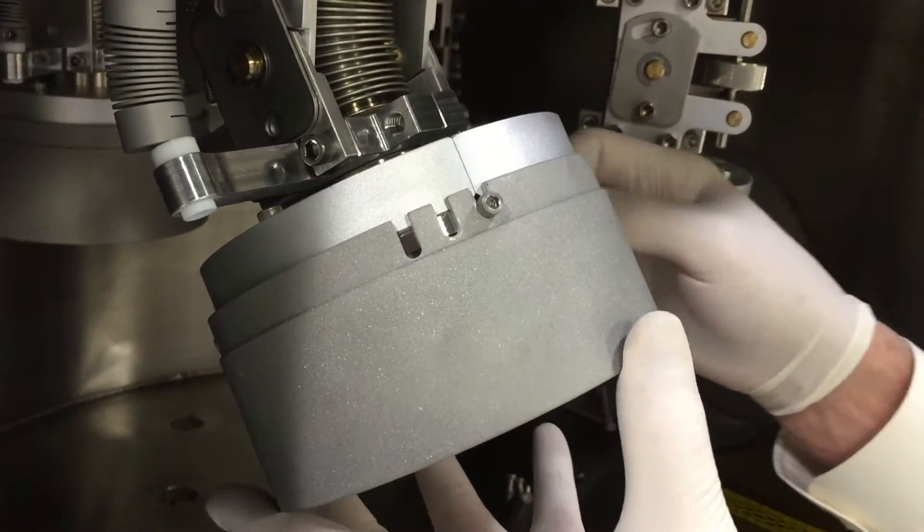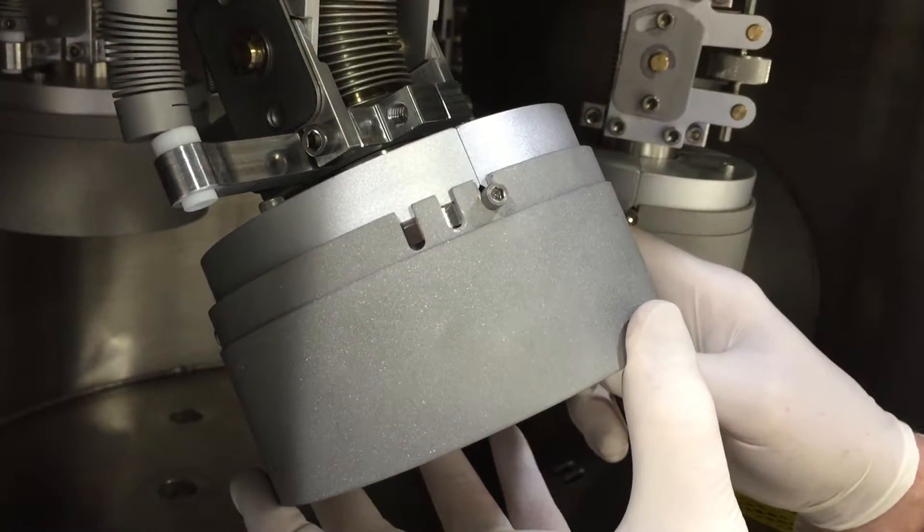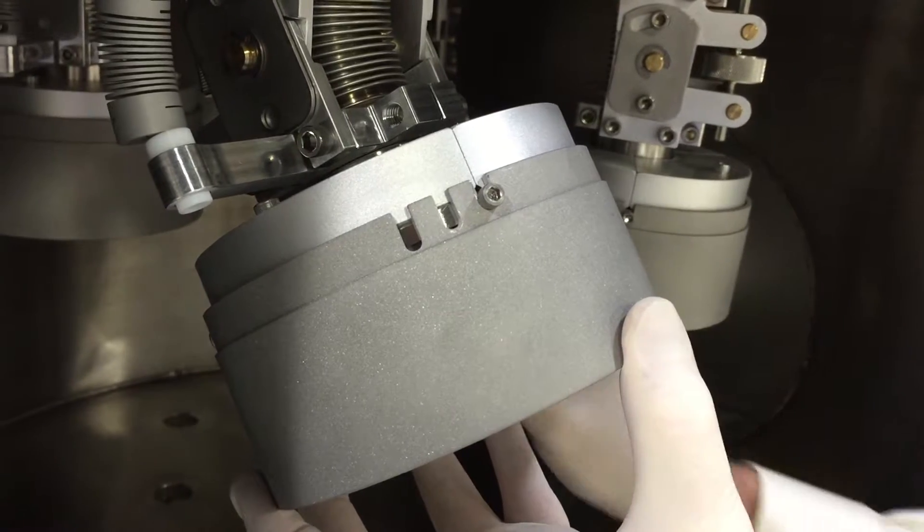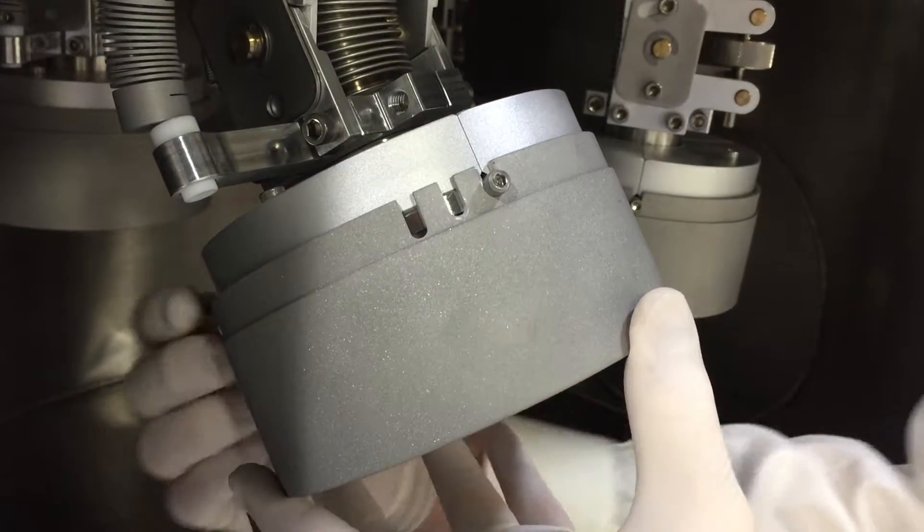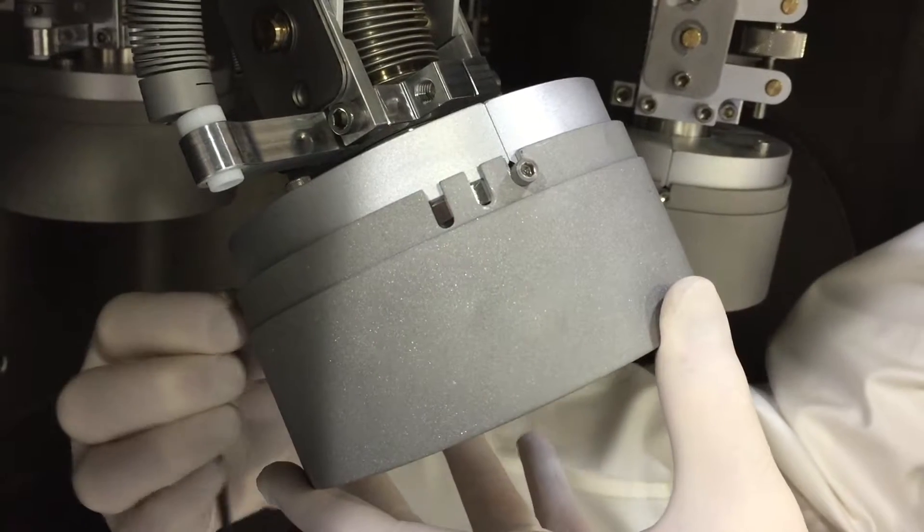Changing a Denton Vacuum Cathode in a Discovery sputtering system is a trivial process. Loosen the three set screws holding the outer target shroud assembly.